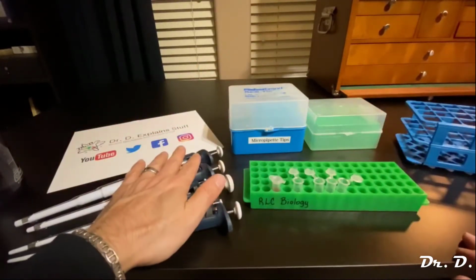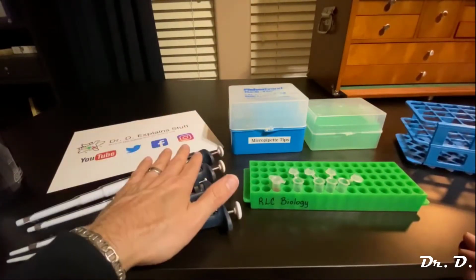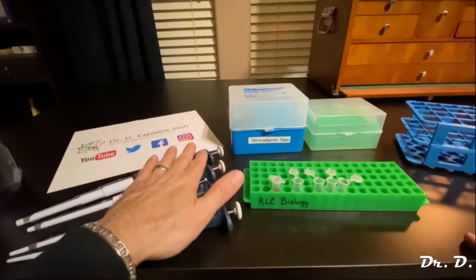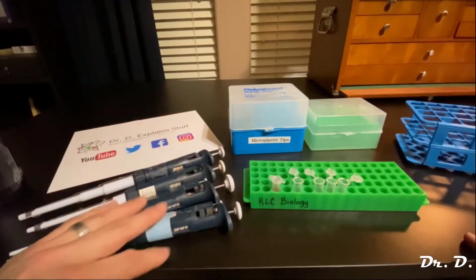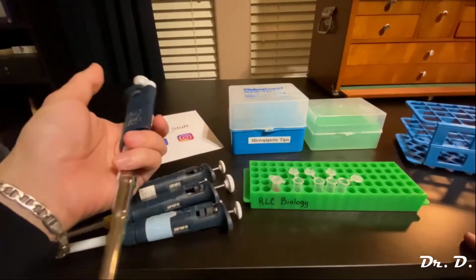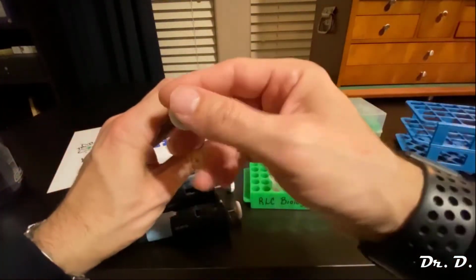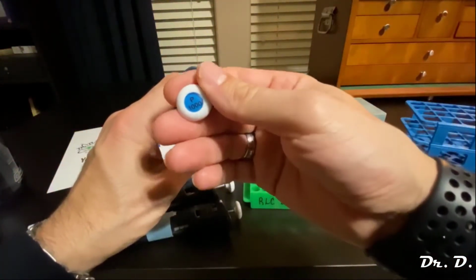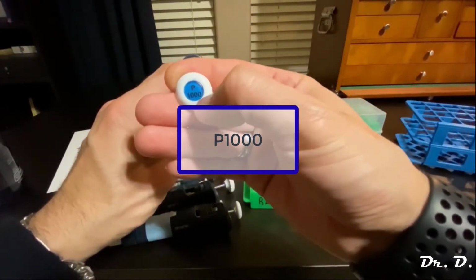So let me introduce the pipetters. These are called micropipetters or pipettemen. There are different size pipettemen. Here's the biggest one that you're going to probably come across. If you look at the top, normally they tell you what they're called. It's called the P1000. So this is the pipetteman for 1,000 microliters.